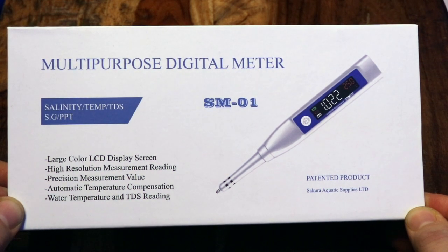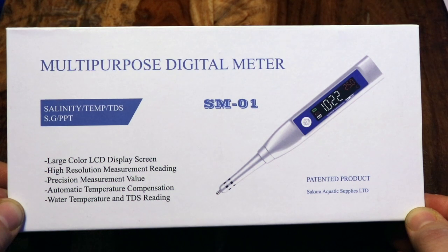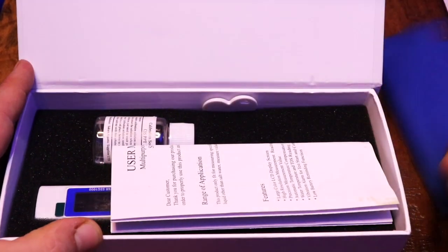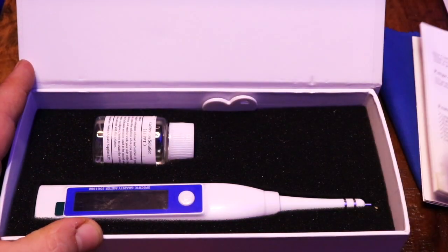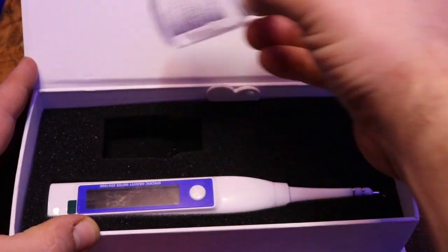TDS stands for total dissolved solids, which is very important with saltwater aquariums because you want to make sure that you have a pure product when dealing with water for your reef tank. When you open it up, you get a cleaning cloth, an instruction manual, a key for unlocking the back of the meter, and some calibration fluid.